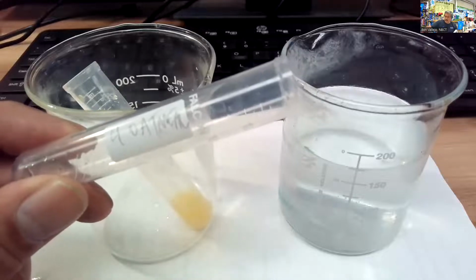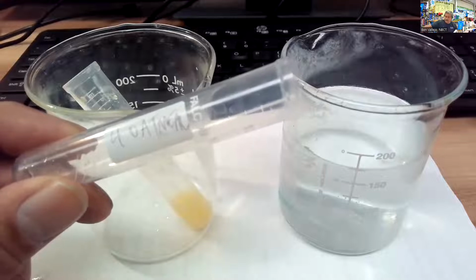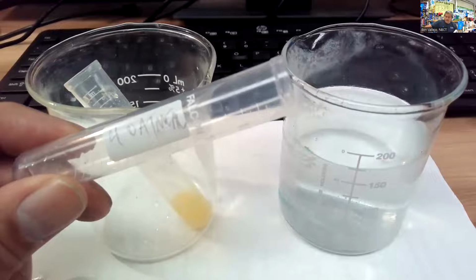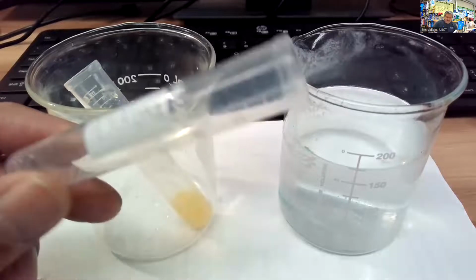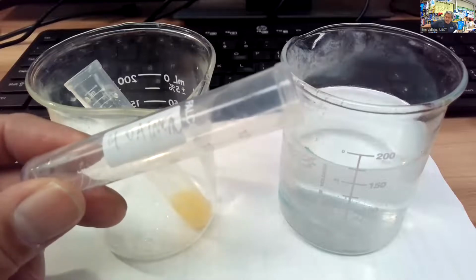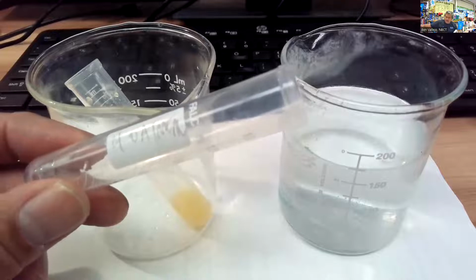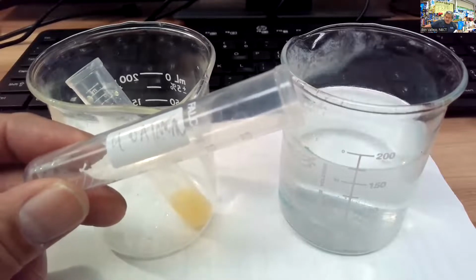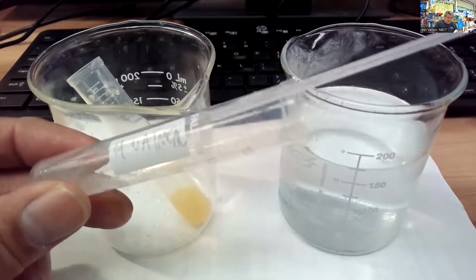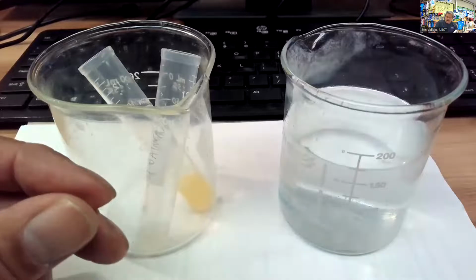I'm going to take that and mix that up again, since it's been sitting a little bit. I want to make sure I get the objects that I'm trying to test in there. So here's the oatmeal. Got an oatmeal chunk that I don't really want. I just want the liquid. It's a little difficult to do since I shook it up. So here's the oatmeal. And there we go. Oatmeal in there.